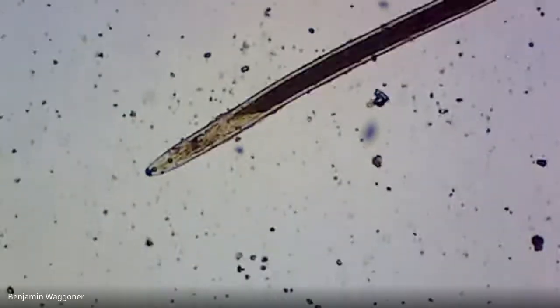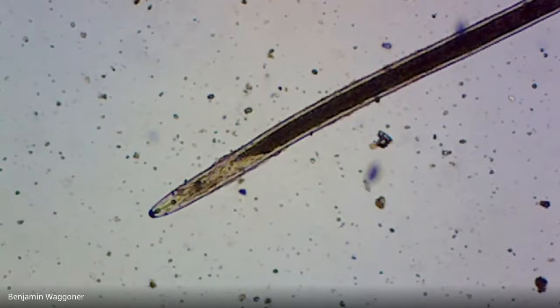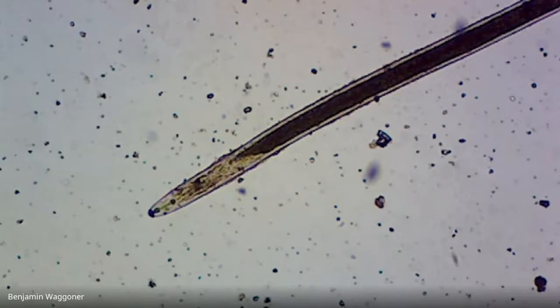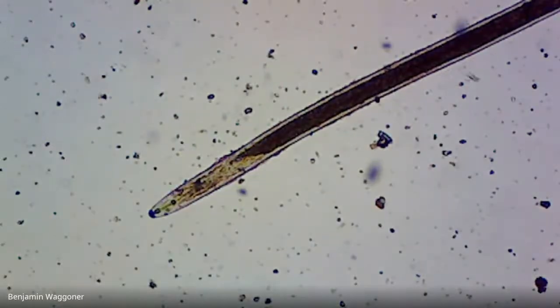Okay, all right. I'm not sure why it's so still and what's going on inside it, but I think that's a big one. And that's the head end, and you can decide what it's got. It might be a dauer, one of these resistance stages that they go through. I'm not sure why it looks the way that it does, but I'm pretty sure that's a nematode head right there. So yeah, you can decide what that guy is or gal. Thing's huge.